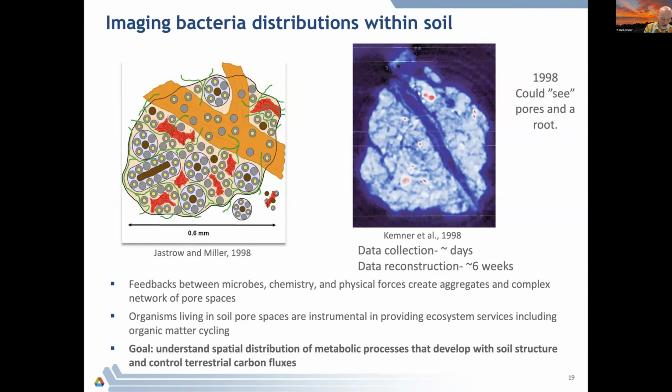So now that we've done the cores, we want to go into the smaller, thinking of these individual soil aggregates and provide, again, some of the historical context. Our group was the first to ever look at a soil aggregate with tomography. This is back in '98. The only reason we were first is we were just in the right place at the right time. Lots of work followed us and advanced us a lot further than we ever did back then.